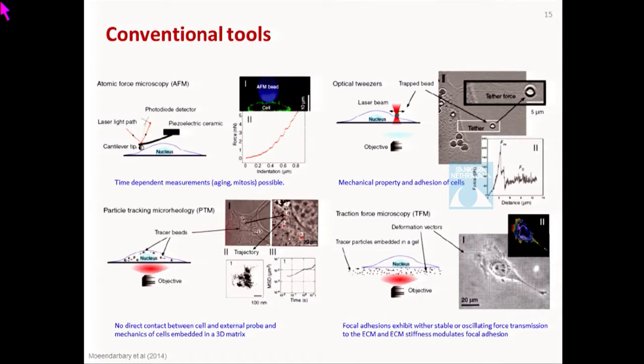You make sure that the tip is in contact with the cell, and then slowly you raise it. When you raise it, when there is a very, very small gap, of about 10 nanometers, you would observe that the tip will suddenly snap into the cell, and that is because of the Van der Waals attraction. So there will be a sudden dip that you observe in the deflection versus force plot.